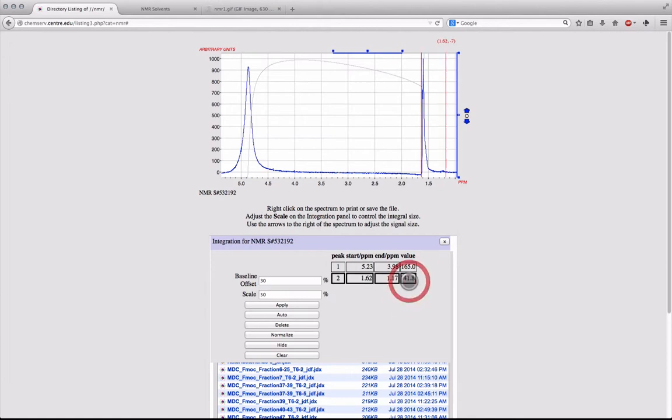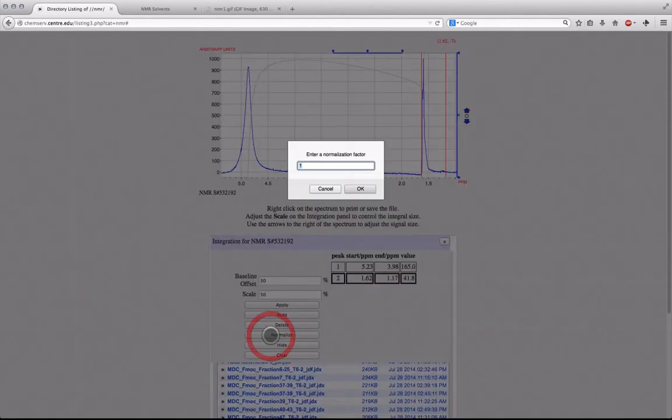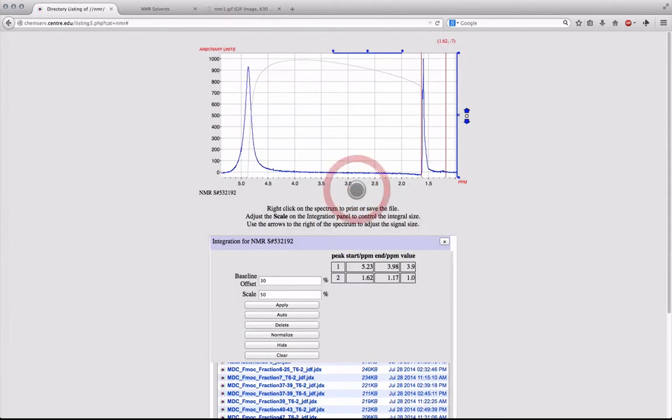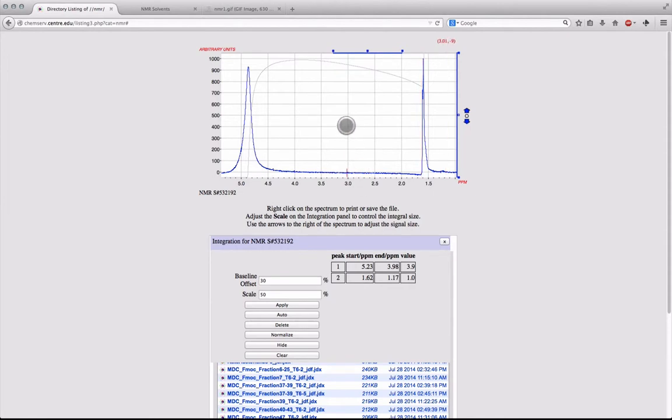After this, the signals need to be normalized. This can be done by clicking on the lowest signal, and then pressing the normalize button within the menu. You can then set your normalization value, and each of the signal values will be adjusted.